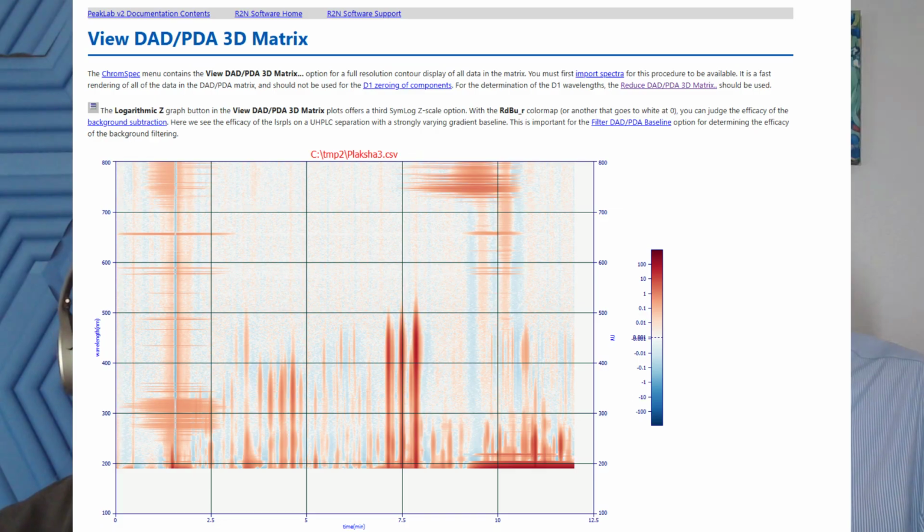I've used the term digital chromatography for that because you're doing post-processing of the data digitally on your computer. You've got chromatography going across the x-axis, and the second variable is now the wavelength. So each of these traces, as I go across in time, would be a separate chromatogram. This particular data set obviously has a large number of components. Some are present at a very trace level, some at a very predominant level, but all of these can be obtained in a single chromatographic separation if you just save your 3D data.